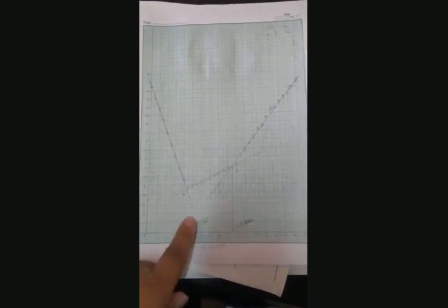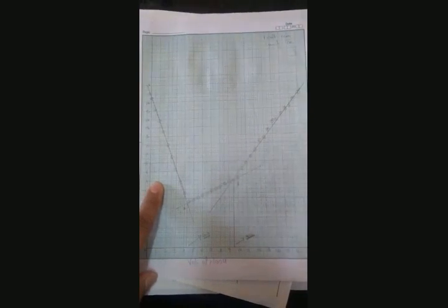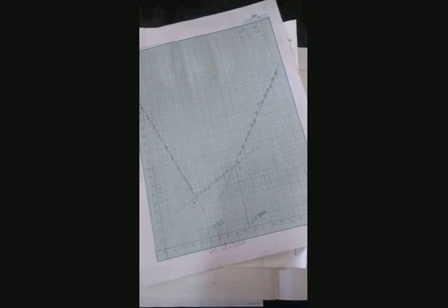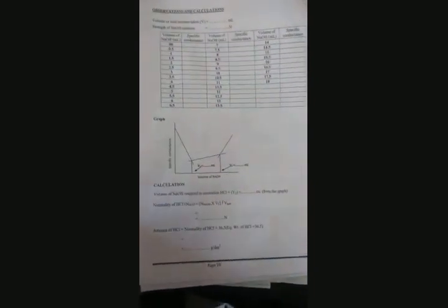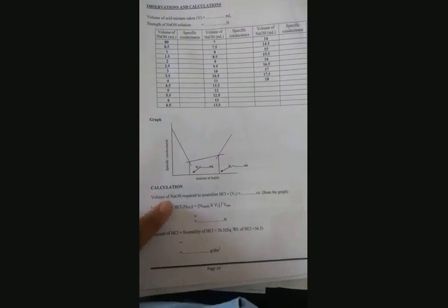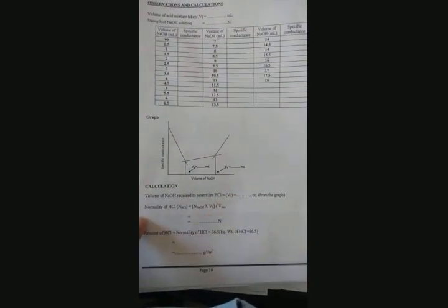So by knowing the volume and the normality of NaOH, you can calculate the normality of acetic acid as well as the normality of HCl. The volume of NaOH required to neutralize HCl is V1 from the graph, as I explained.